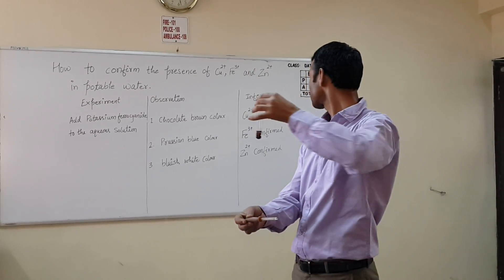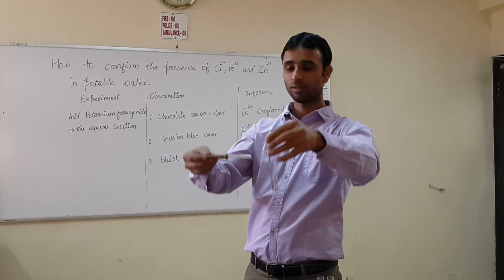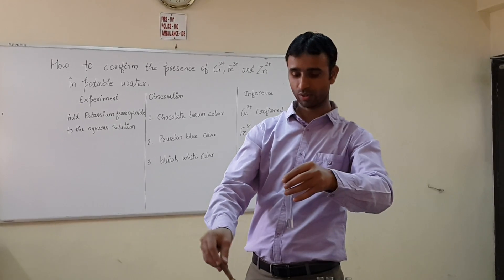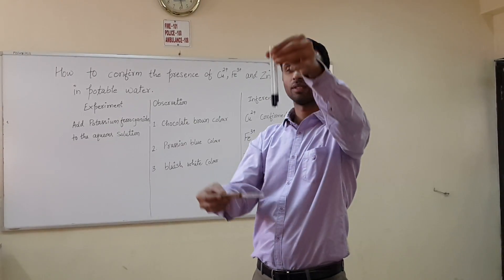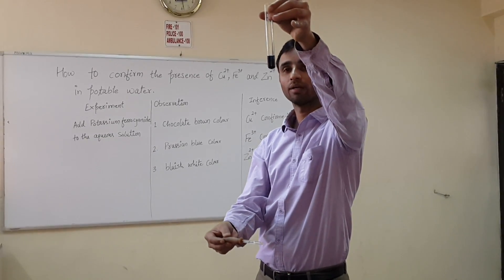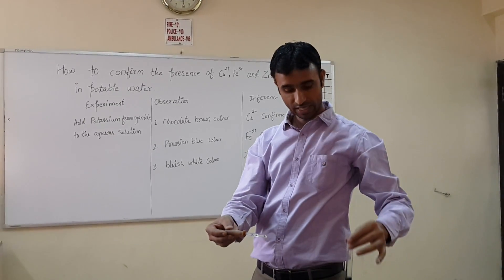This is the second solution. When we add potassium ferrocyanide in it, see, this is blue color. It confirms the presence of Fe3+ ions.